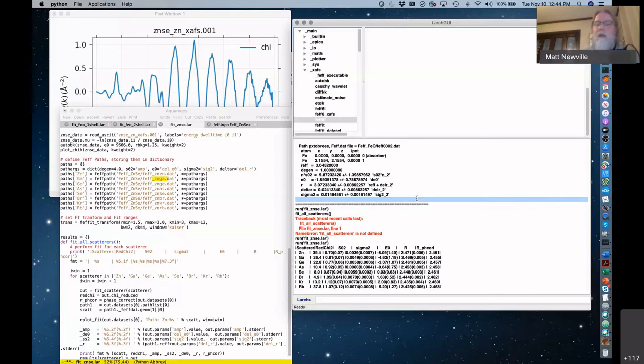And the PCA and all of the linear algebra approaches work just as well on any aspect of that. Actually, the first thing PCA does is get rid of the mean, so then it's all differences anyway. So you can definitely do that. Many people will even take the second derivative and look at that. Those are all fine things to do. I don't think it's going to change your results a lot. It can change your sensitivity some.